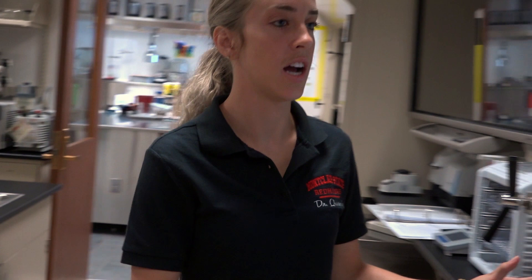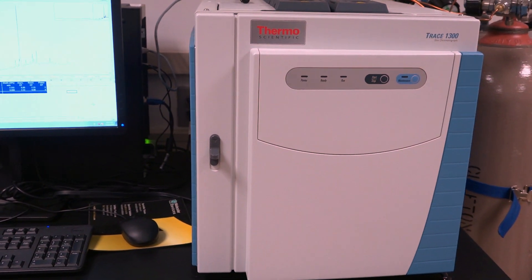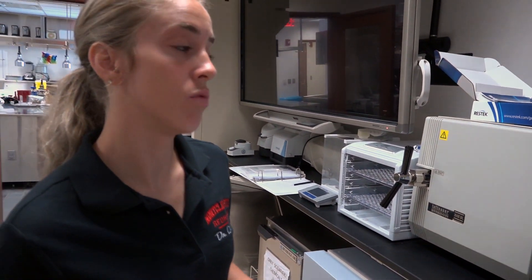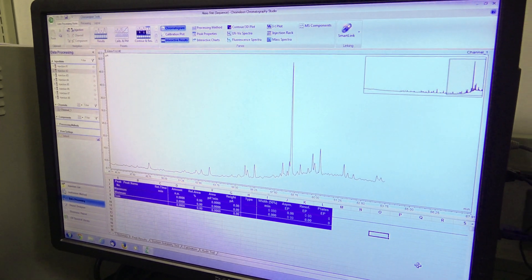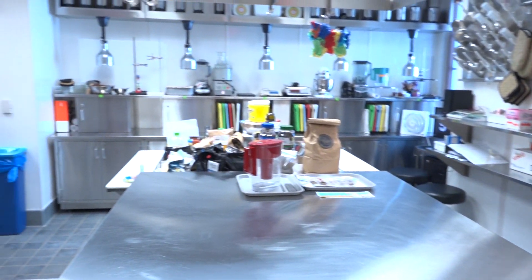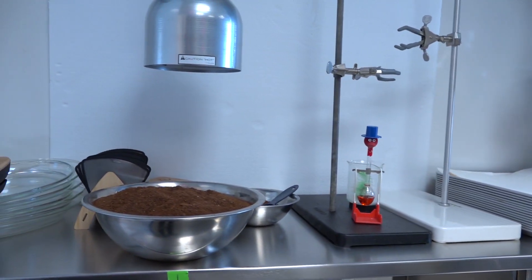This is actually the machine I'm using for my thesis project — a gas chromatograph. I'm working with the volatile chemistry of cold brew coffee, trying to extract the flavors of different types of cold brew coffee based on their grind size or brewing times. This is the kitchen. What I really like about it is that it combines two things I'm passionate about: cooking and being creative in the kitchen, and the science side in the other room — so we can combine those together for product development, research and development, and other things we encounter in the graduate program.